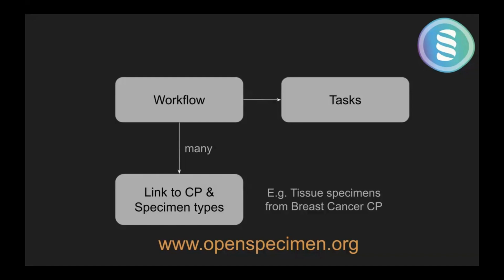For example, one common filter we apply is if the specimen's received state is to be received, then it goes into the receive workflow. So if the specimen has been collected but not yet received, push it into the workflow for receiving. So it's not just based on specimen type. You can use any field in the specimen to limit the specimens to the workflow.